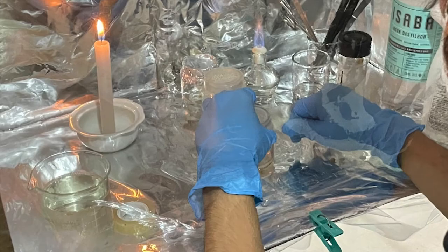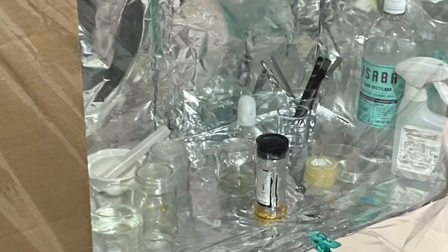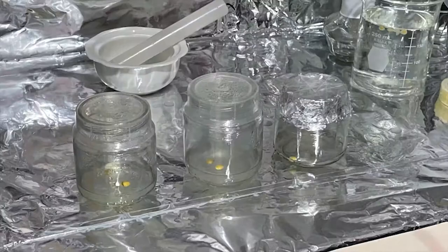When finished, the jars were sealed with paraffin, giving it 5 tight turns. This was how the experiment was left. The containers were left inside the box and in a room with light and room temperature.